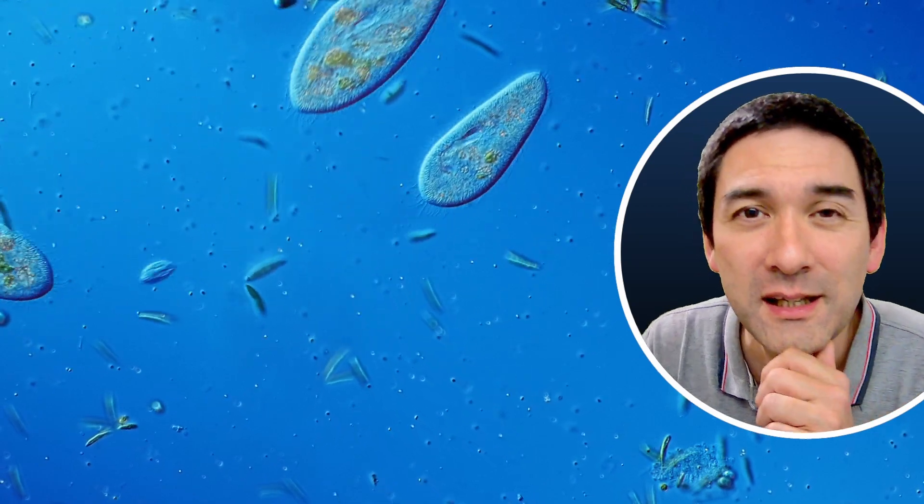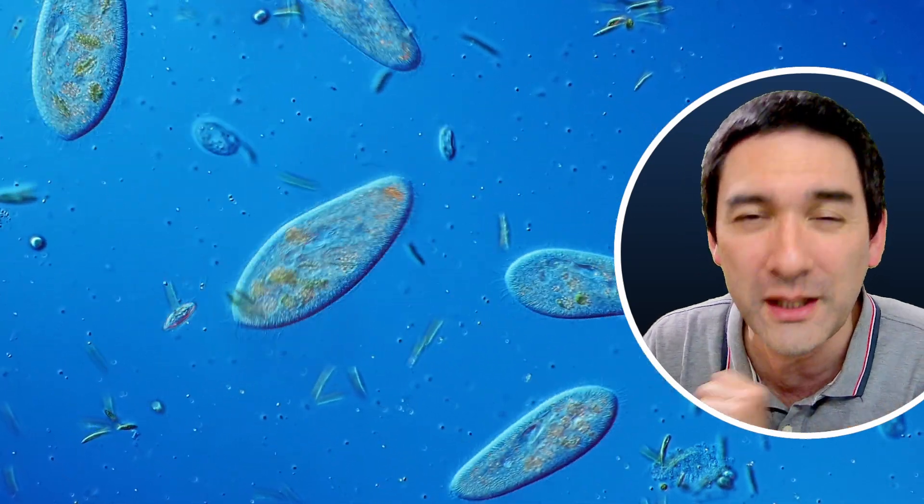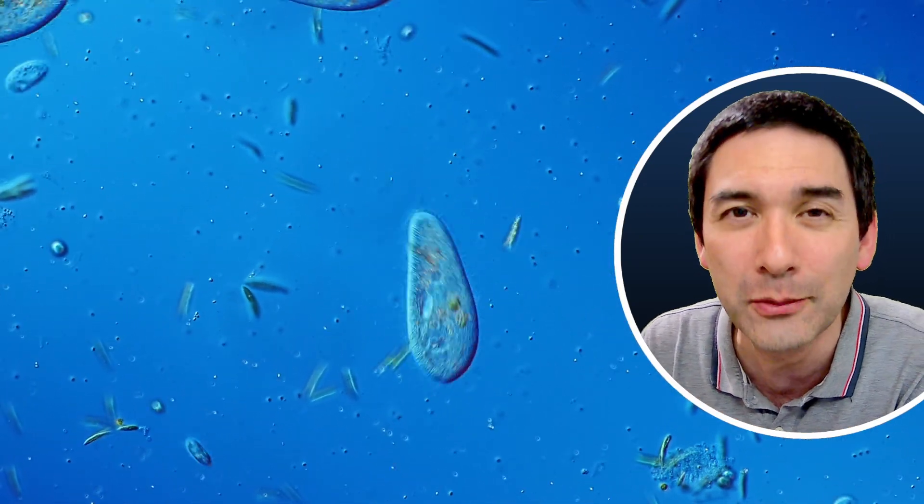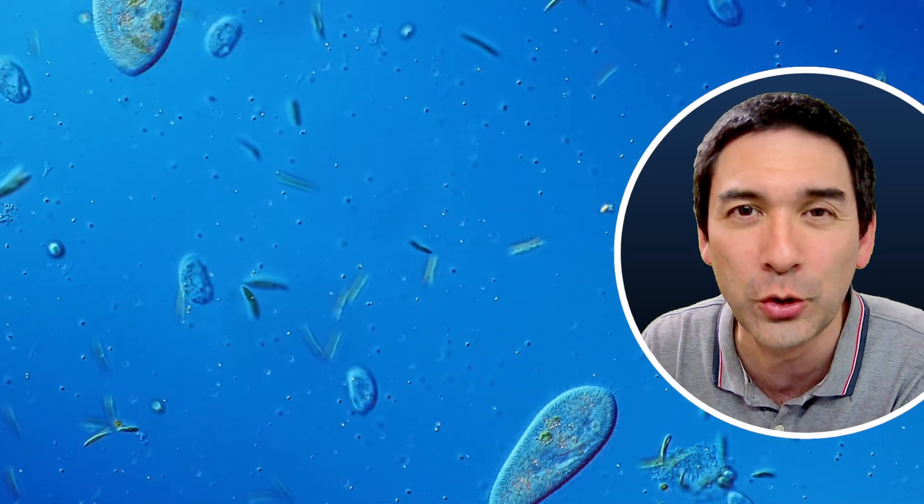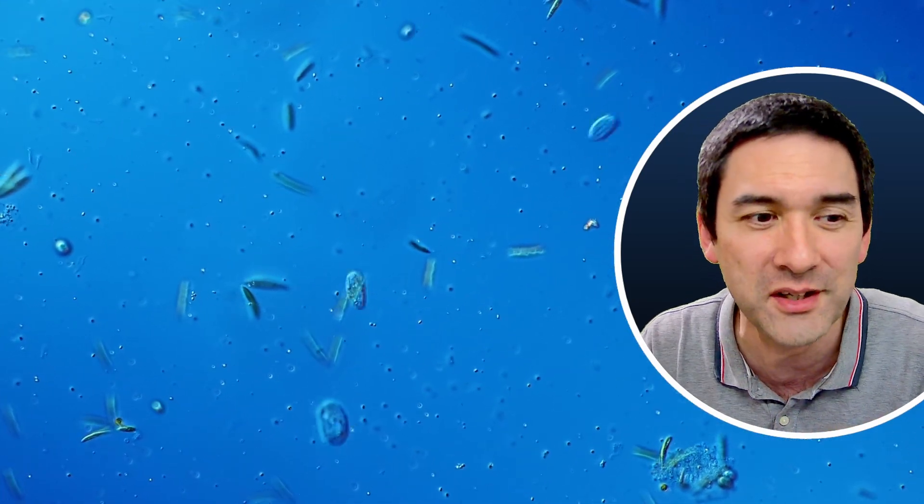However, I mean, in the Dead Sea, for example, which is extremely concentrated, they did find microorganisms that are able to survive that area as well. So they're used to the high salt concentration, but not those paramecia here.